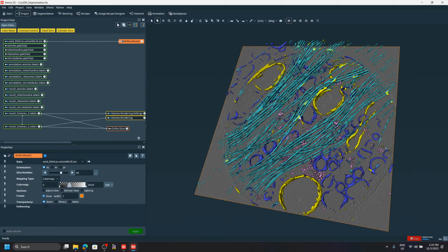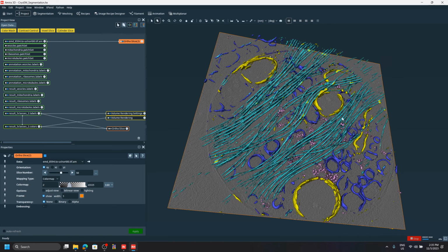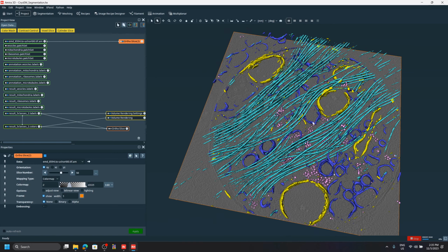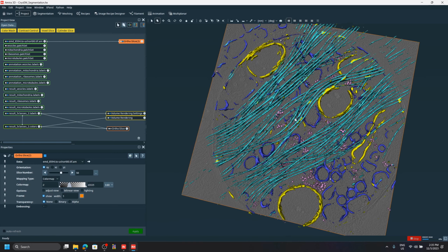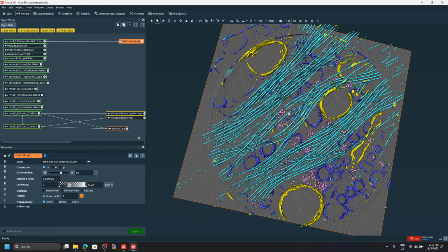So if you open that project, you're gonna see this. This is already the final segmentation. I'll just quickly go through the training input, so you have a feeling of how that looks. In this particular example, you have, I think, 4 different objects or materials.